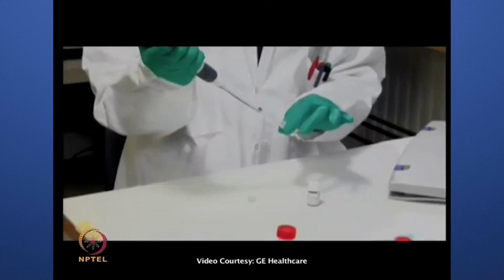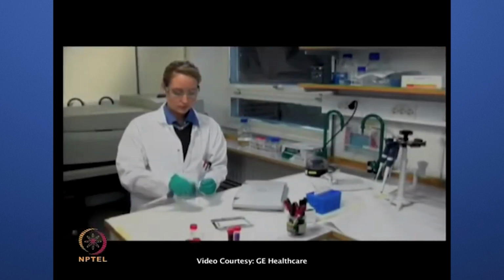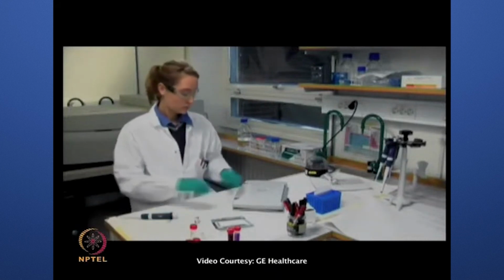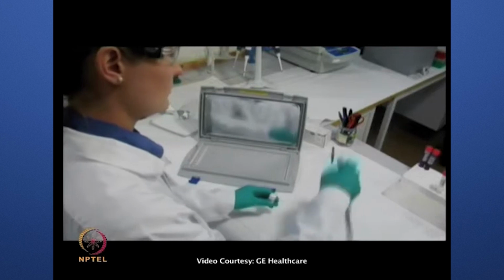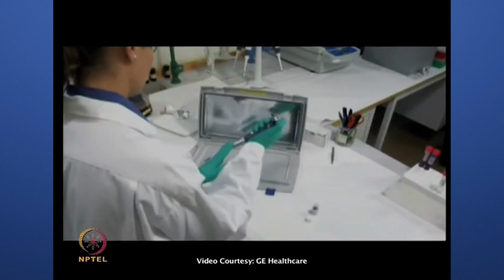The first step in 2D electrophoresis is to prepare IPG strips for rehydration. Prepare the streak rehydration solution by adding IPG buffer corresponding to the pH interval of the strips used, and add the solution in the lanes of the rehydration tray.